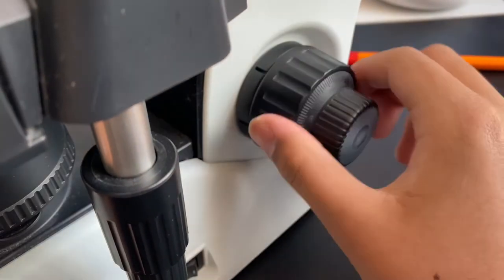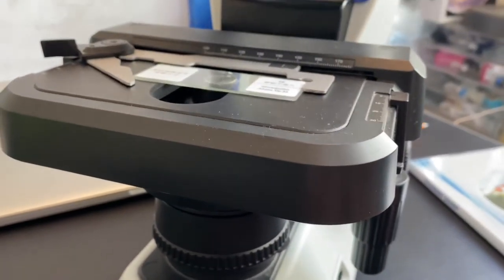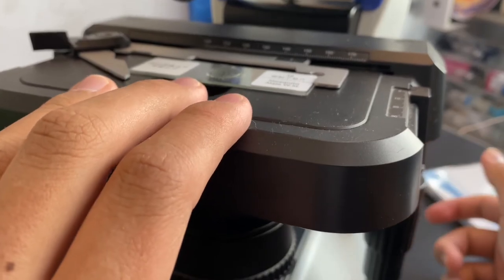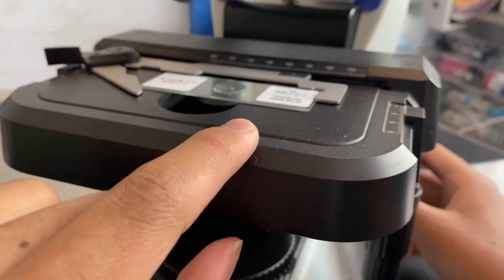Now the stage is a bit more loosened, so it kind of drifts off. You can actually press it down by your hand without using the focus knob.